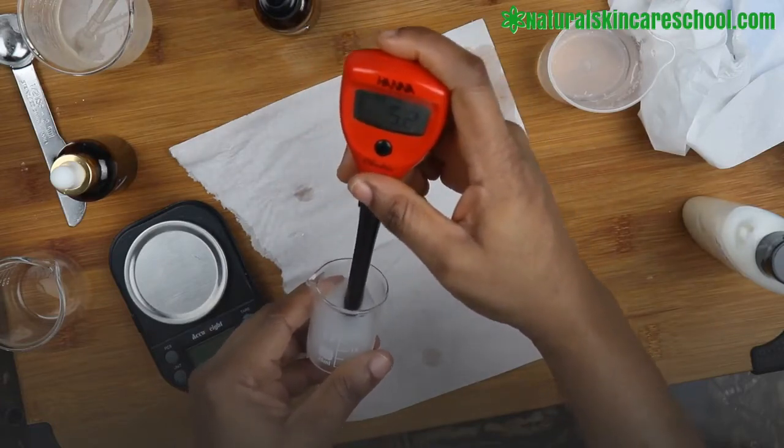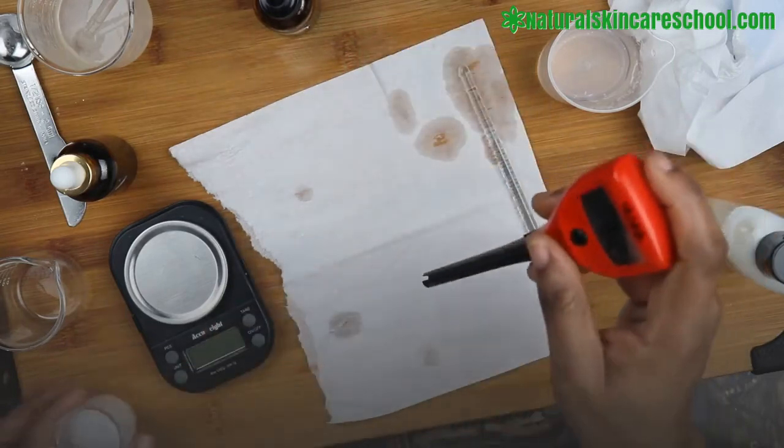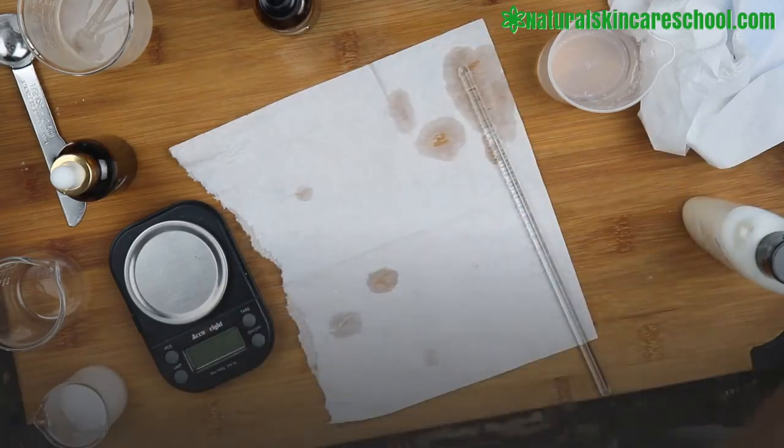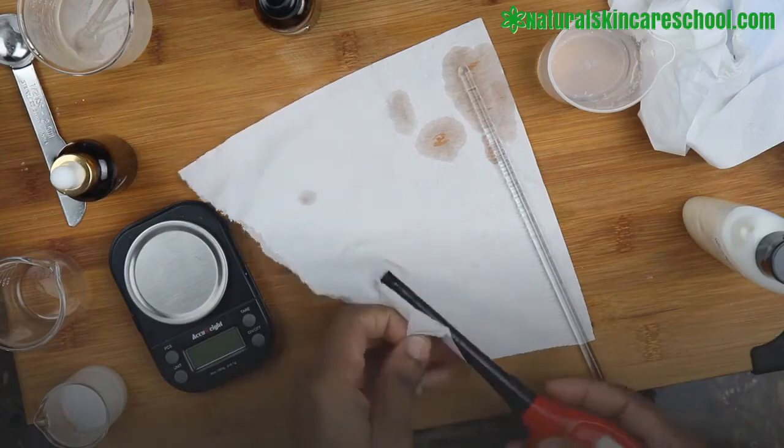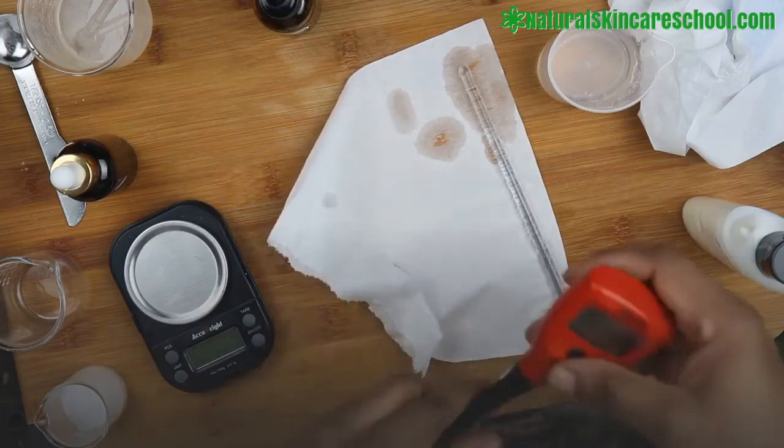So right now the pH is 5.2. The pH is very perfect. This is a very good lotion. The pH of the skin is 4.5 to 5.5, so 5.2 is very okay. And that's how you check the pH of your lotion.